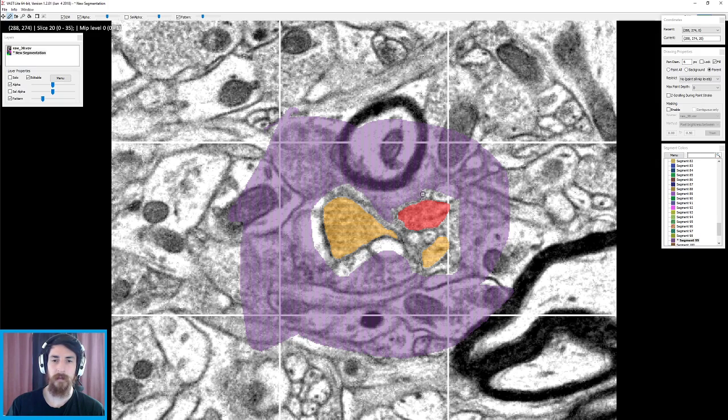Okay. Let's get closer. That's a little too close. Alright. Nice. Get this right here. A little bit too close. Too close. That's fine. What are we looking at? What are we dealing with? Here we go. This needs some. Yeah. Okay.